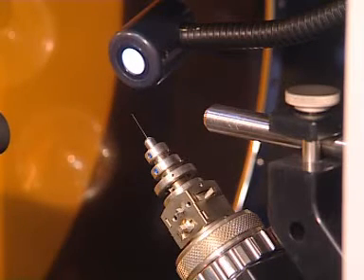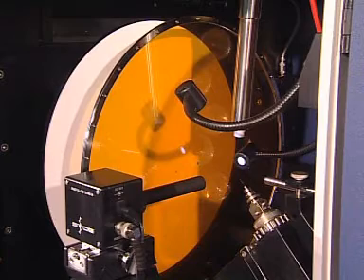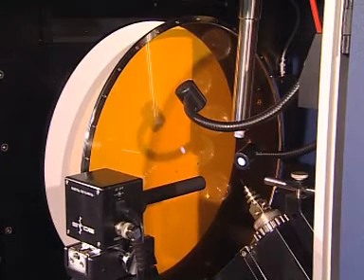The next step is data capture. After each frame, the image disk of the detector is scanned by a laser beam, reading the data as from a compact disc. Then the disc is erased by exposure to powerful halogen light.